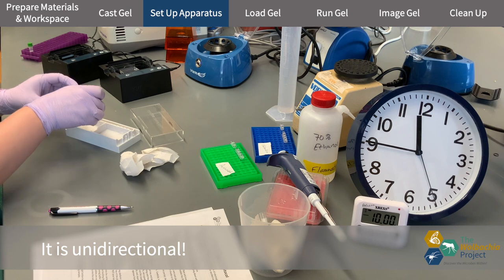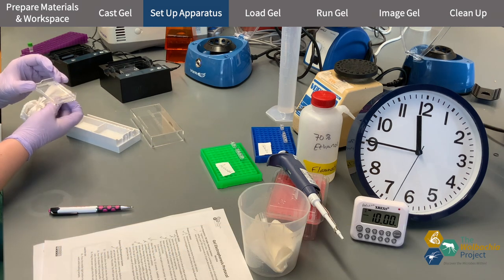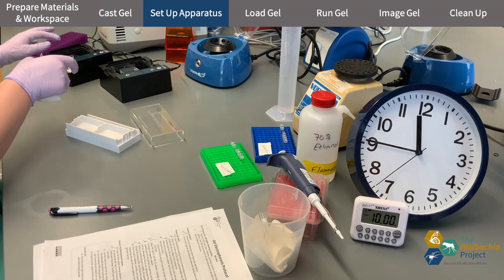Sometimes there's agarose that leaks around the clear plastic tray. This is totally normal and you can see I just wipe it off with a paper towel before I add it to the buffer tank.